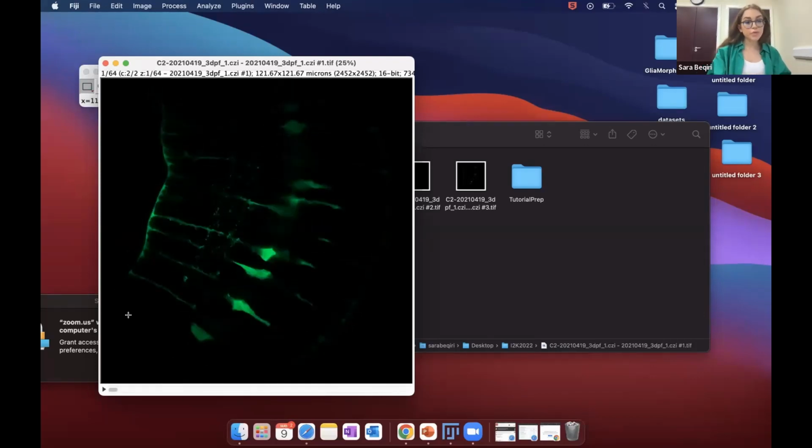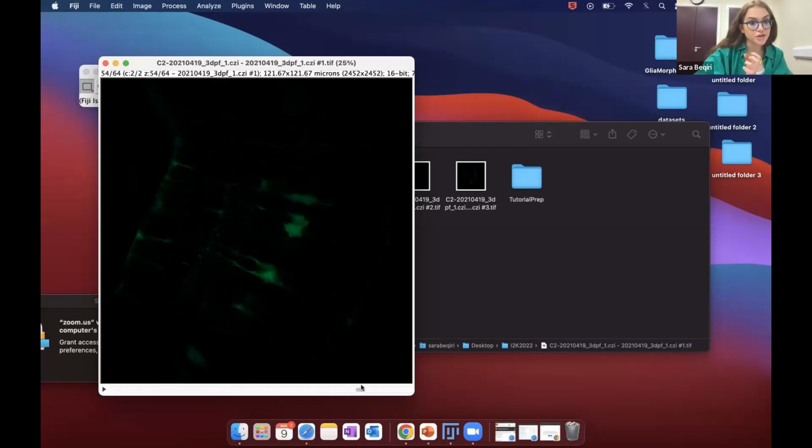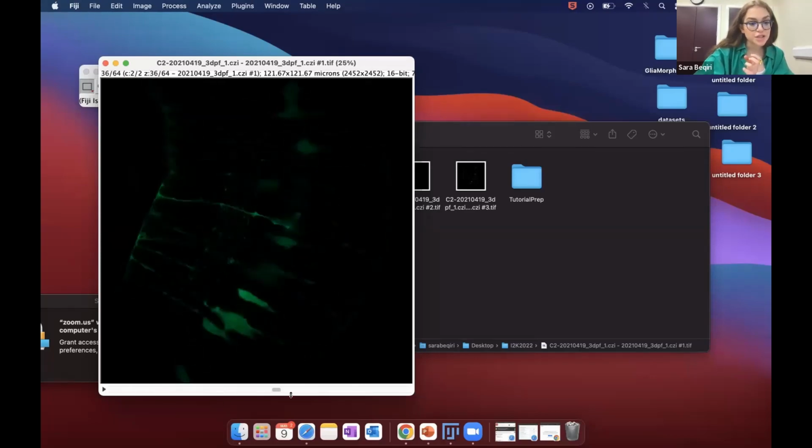All right, so an important point to check for here is Z-axis decay. So due to point source illumination, when we're taking these images using the microscope, we have a problem with tissue penetration. So sometimes the top layer can be of very good quality, very strong signal, as you can see here, but then the deeper layers might have poorer signal due to lower penetration. So what we do by just checking with the slider is we can investigate for that as well. So it's an important point.